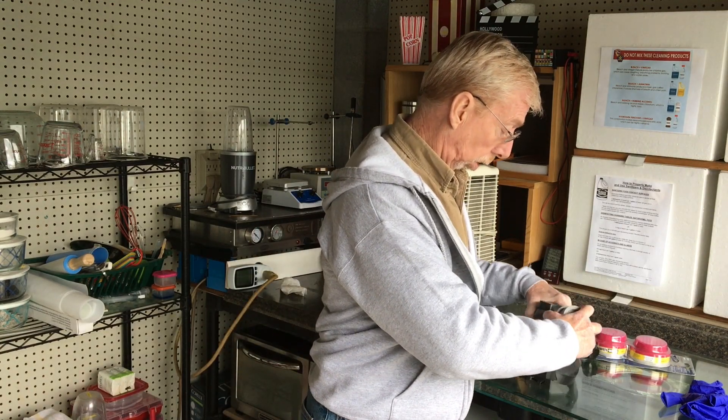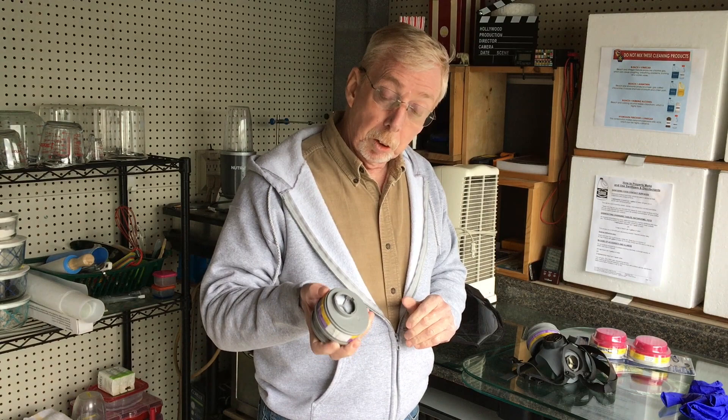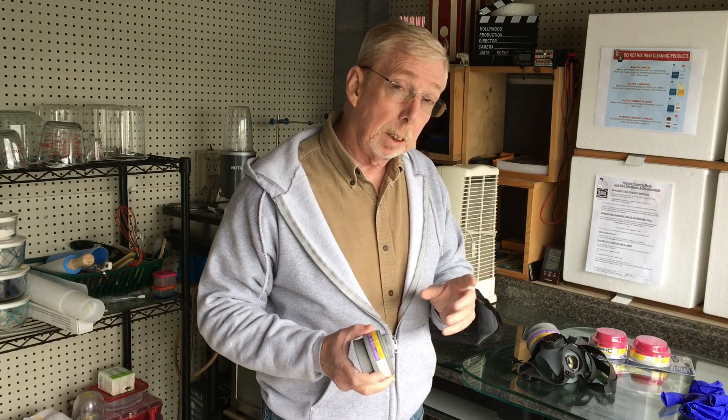These are eight-hour cartridges and they can be sterilized. The simplest and best way to do that is to place them in an oven at 160 degrees Fahrenheit for 30 minutes. This will obliterate everything on there — 160 degrees Fahrenheit for 30 minutes, right on the money.